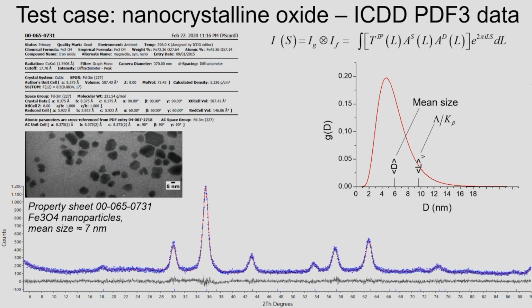But that's it. And you see now, the double Voigt gave 9.5, which is way higher than it should be, whereas now we are more comfortable with about 6, which is not too far from 7. That's enough for the quality of this data. I will show you better quality data, which you can obtain from your home instrument or synchrotron, and in the files you can download. Okay, now let's move on with strain.